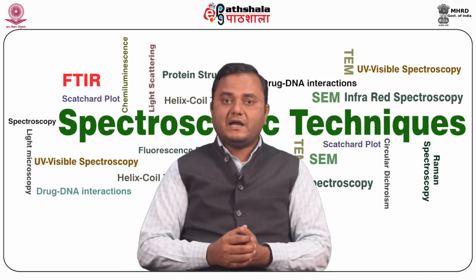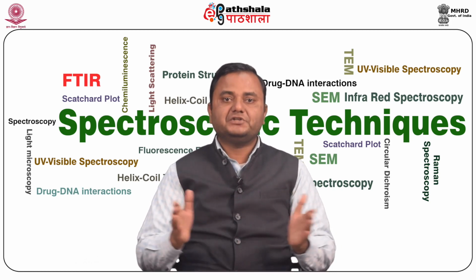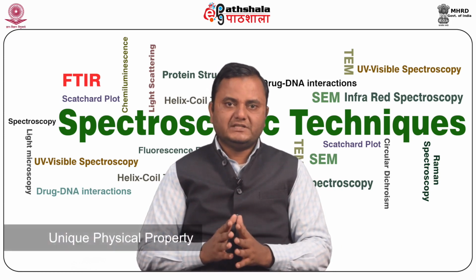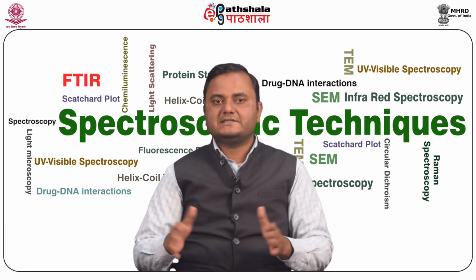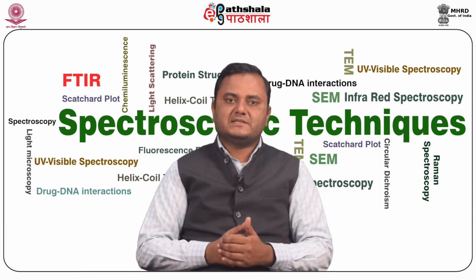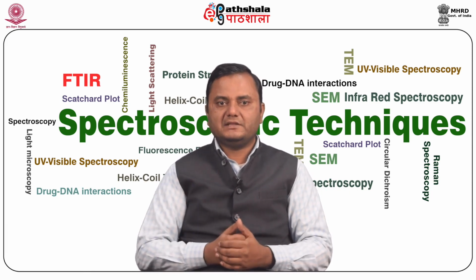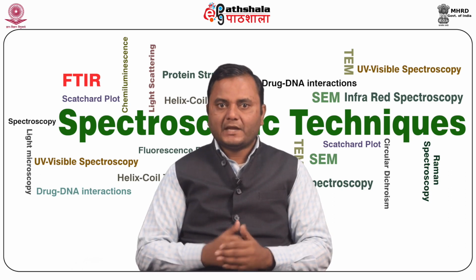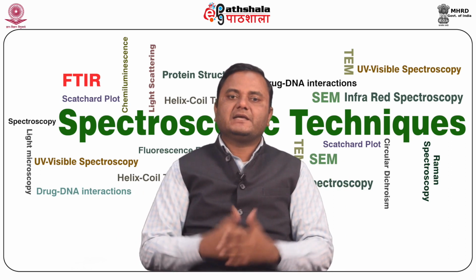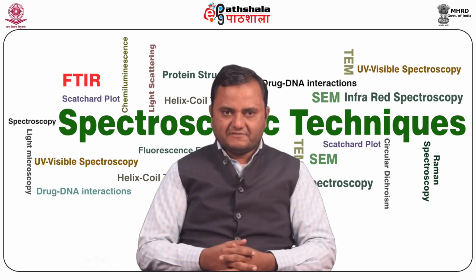Now we talk about the IR spectrum. The IR spectrum is actually the vibrational spectrum of a molecule, and is considered to be a unique physical property and is characteristic of the molecule. IR spectroscopy measures the bond vibration frequencies in a molecule and is used to determine the functional group mainly. And based on that functional group, you will be easily able to identify the chemical properties and what the actual chemical compounds or trace material are as well.